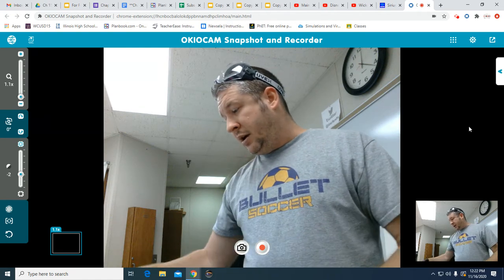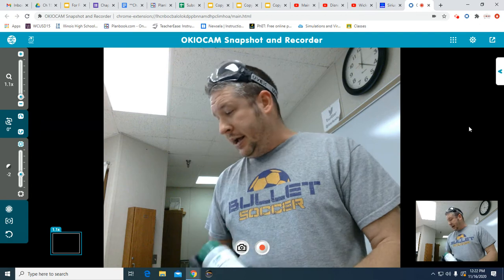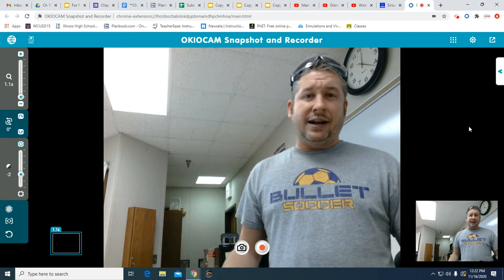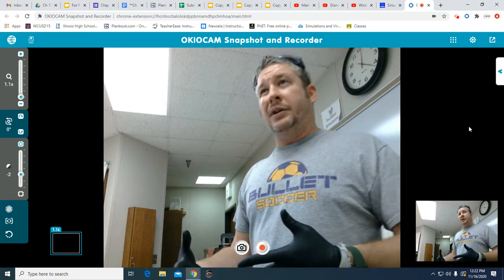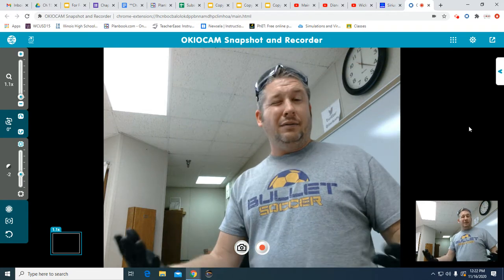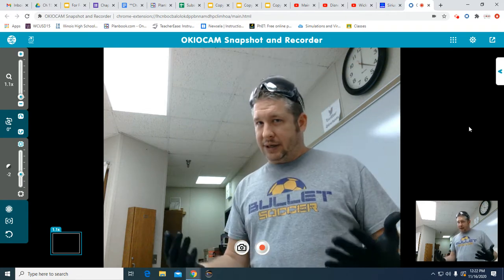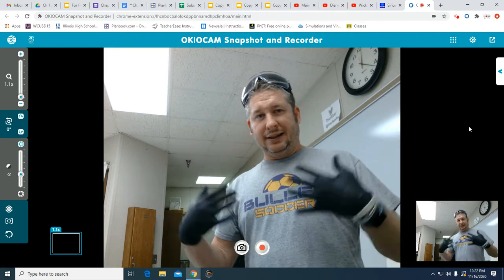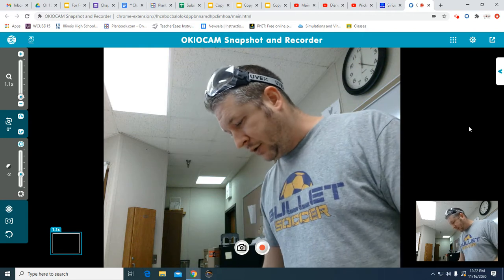Also, we'll be using silver nitrate. Silver nitrate could possibly be toxic by ingestion. It can stain clothing. So you don't really ever want to do this lab or any other labs if you have really nice clothing, unless you have some sort of apron or lab coat to go over your clothes, okay?